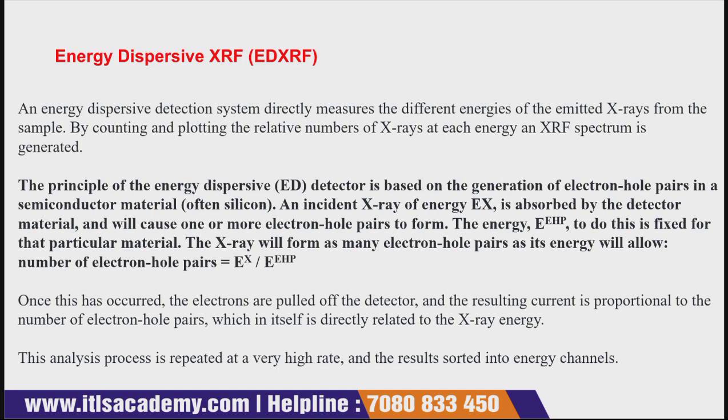Energy dispersive detection system directly measures the different energies of the X-rays emitted from the sample. By counting and plotting the relative number of X-rays at each energy, an XRF spectrum is generated.